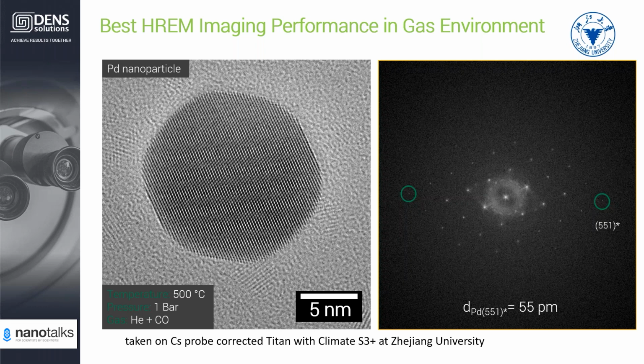Actually, we know for catalysis reactions, there are a lot of sample preparation tricks, because people want a large amount, but people also don't want the particles to be too close to each other. Because if they are too close to each other, sintering, like the growth of the particles, could happen during the heating, which directly deactivates the catalyst. So it's like, I want as much as possible, but on the other side, I want them to be as dispersed as possible.